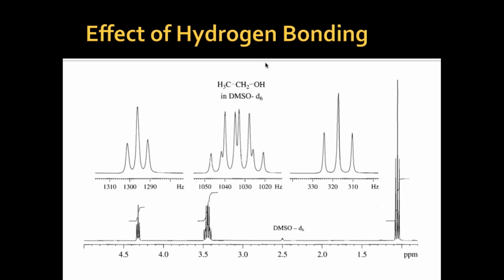Is absent. What does that mean? Now the hydrogen is available for the coupling. So what will happen in the proton NMR?